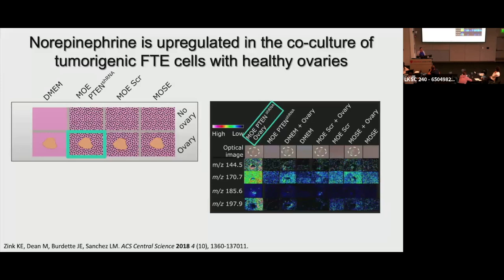So I'm okay with the fact that this isn't quite as pretty as some of the other stuff people have been showing. But you can see here, we can see signals like, let me see. I wonder if I can just use this instead. That way everyone can see it. Okay, yeah, right. So things that are ovary associated, things that are missing from the ovary, or things that increase in abundance in specific co-culture conditions. So we were very excited to see this.